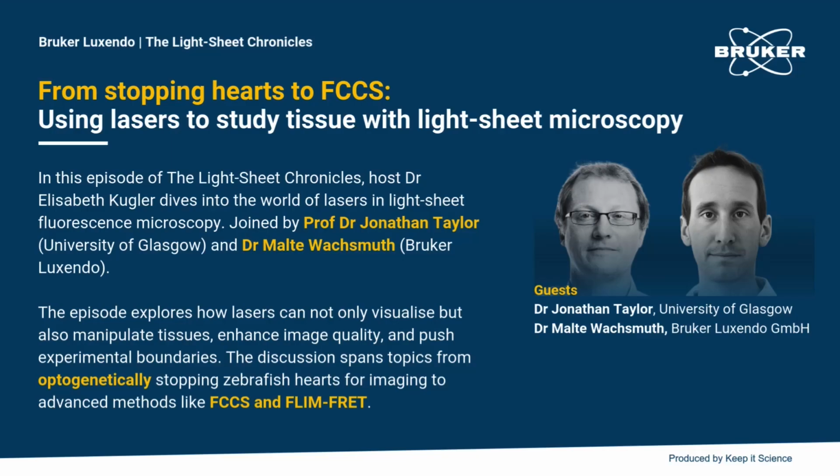Very amazing work. One question I did have on that side: with the beating heart obviously distributing the forces to the surrounding blood vessels, and we know that, for example, the Windkessel effect can be really impactful, especially around the gills and the brain, could that be something where you use these tension sensors as well? So you see the tension that the tissue just around the heart is being impacted by? I think there's a huge amount to explore, and we're starting out with just one organ, because at the moment we're quite limited in our field of view.